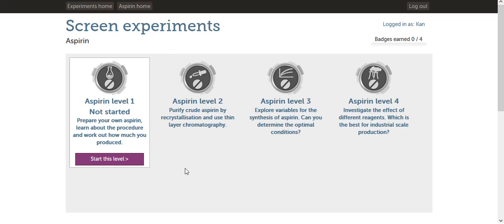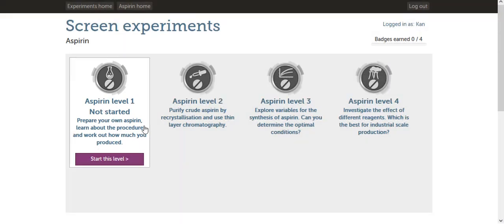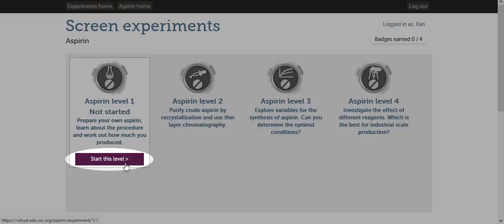For this assignment, we will be doing Aspirin Level 1. Click the Start This Level button to begin.